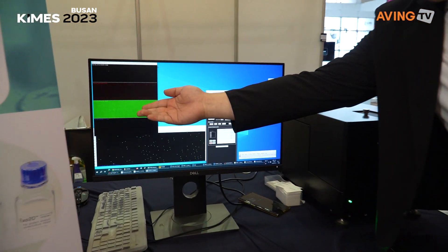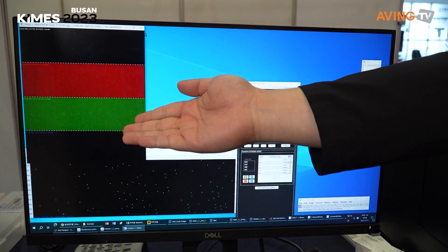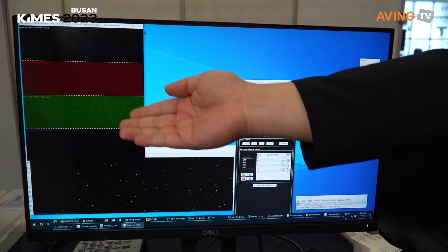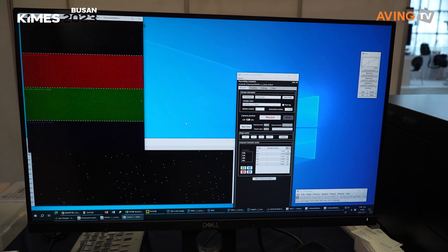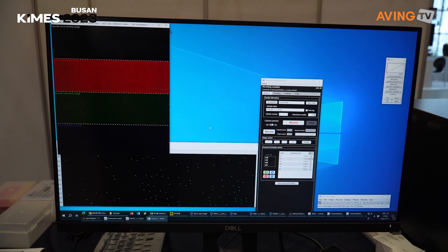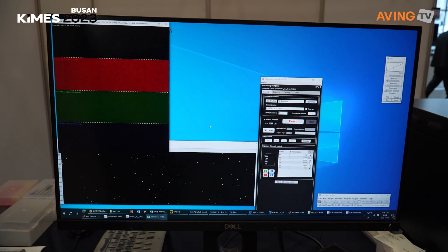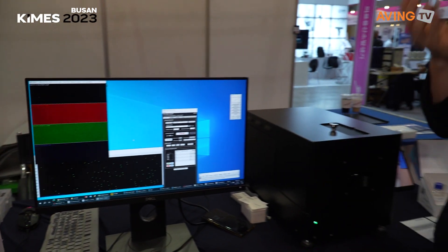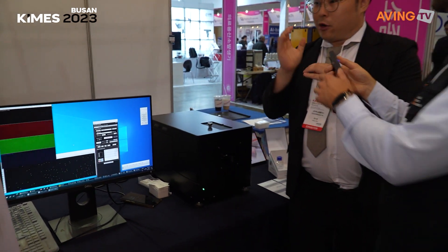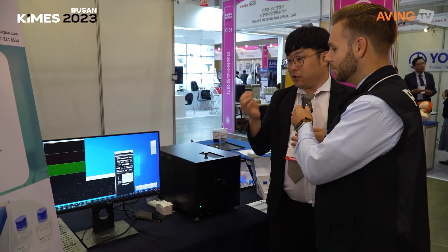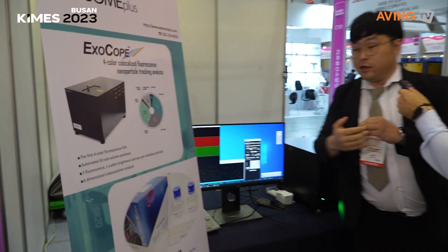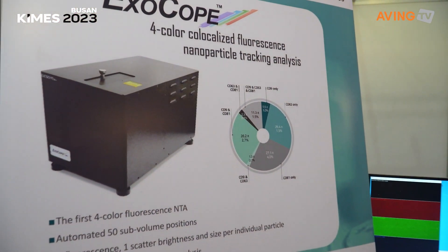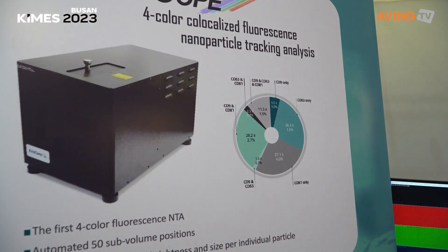It tracks 100nm nanoparticles. We can see the particles and count how many particles are present. This is the exo-dome analysis tool that we can use to analyze samples.